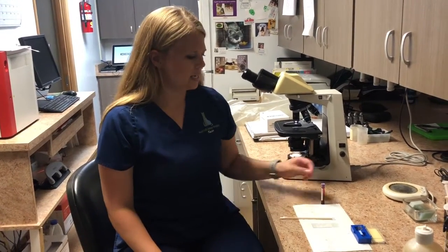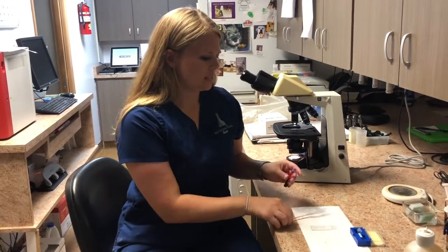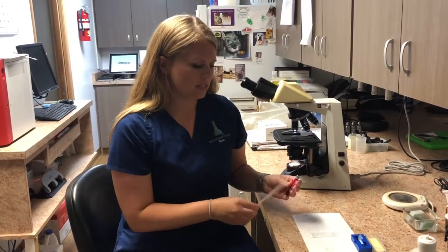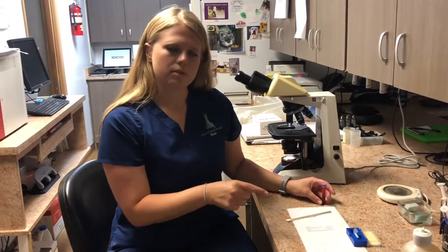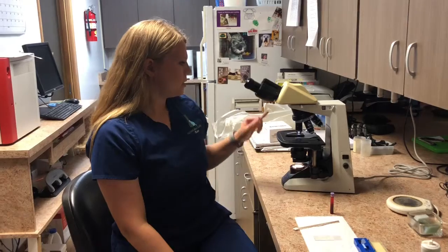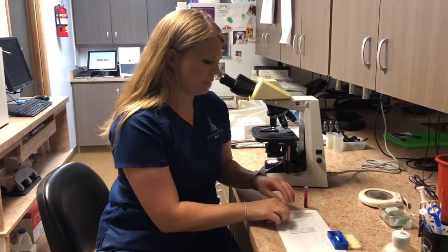This video, I'm going to demonstrate how to perform the heartworm direct smear analysis, where I am looking directly under the microscope at a direct drop of blood, looking for heartworm microfilaria. How that happens is I'm going to use my 2 applicator tips to get a drop onto the microscope slide, and then place a cover slip directly over. And then I'm going to review it under my microscope at the power of 10, just doing kind of a scan through, kind of like in a grid pattern, looking for any moving microfilaria.